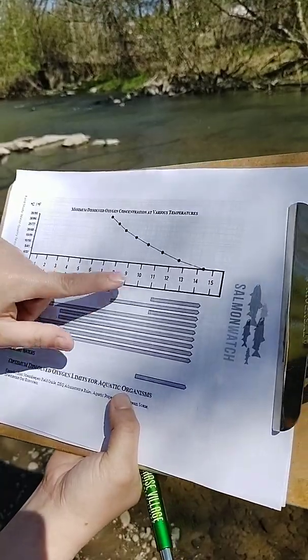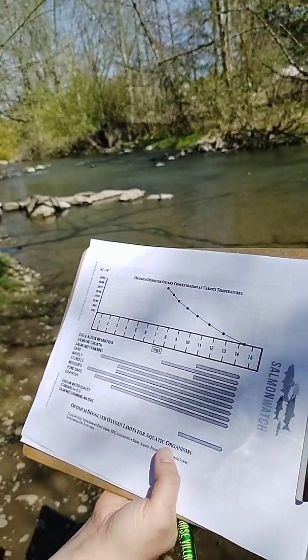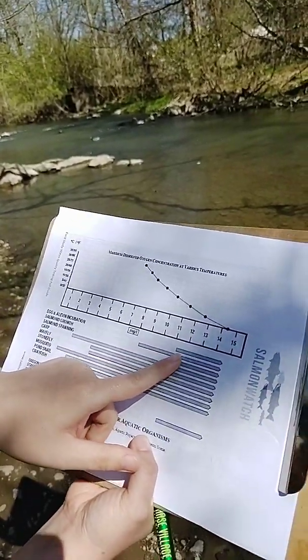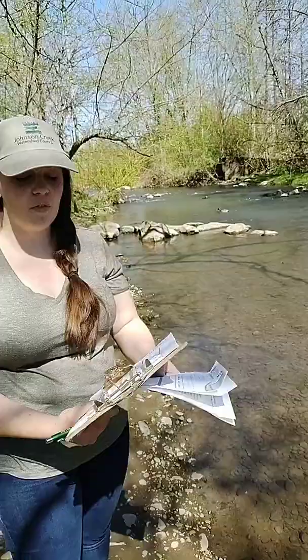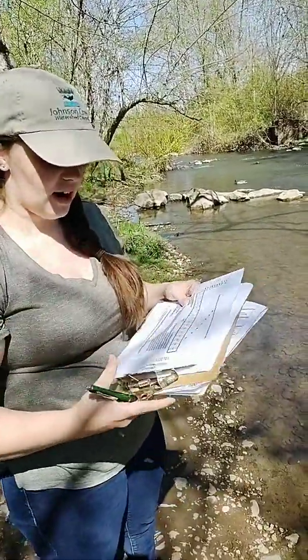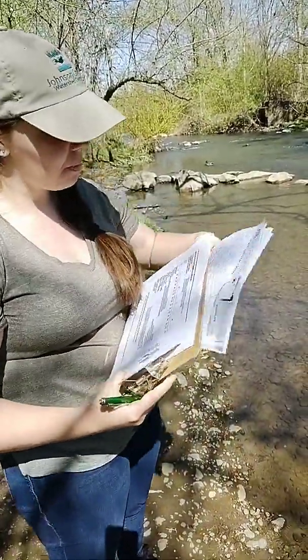So overall, with our 11 score, I'd say the dissolved oxygen concentration is pretty good. It barely covers salmonoid spawning and egg and alevin incubation, so it could be better. But overall, 11 is a pretty decent score. So now we're going to go to the next graph, and that is temperature.